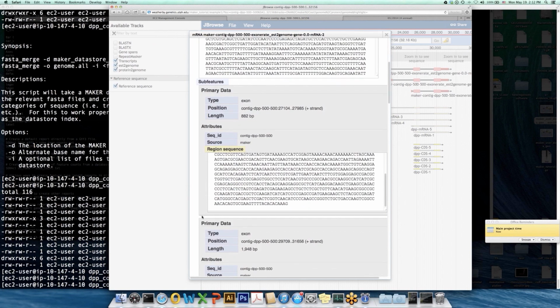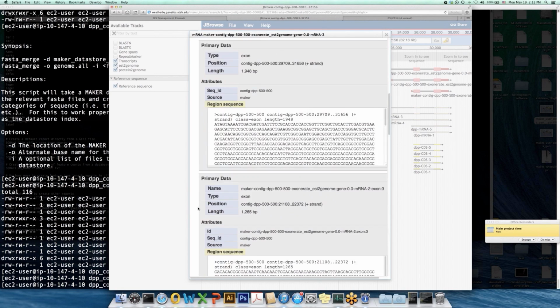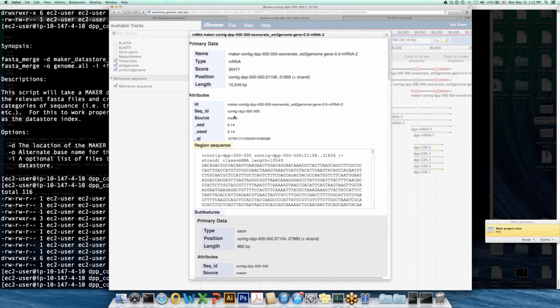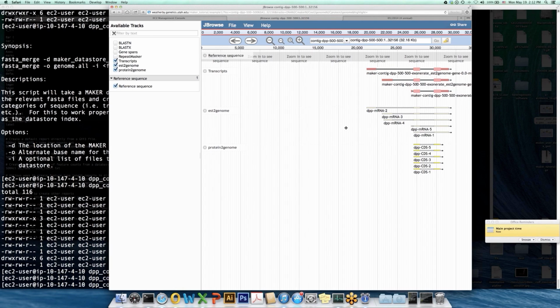And if we were to process the whole genome, we could sort genes based on their AED values to isolate the genes that had the most mismatch with the evidence and focus our annotation efforts on those. And we'll actually have an example where we're looking a little bit at how AED can be used to merge legacy annotations.